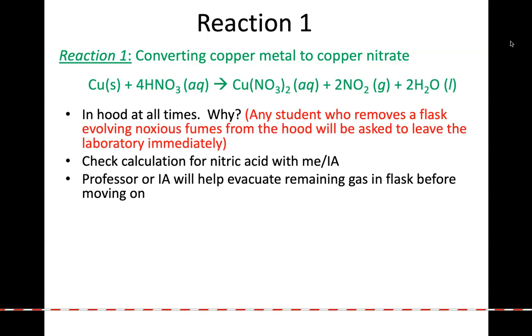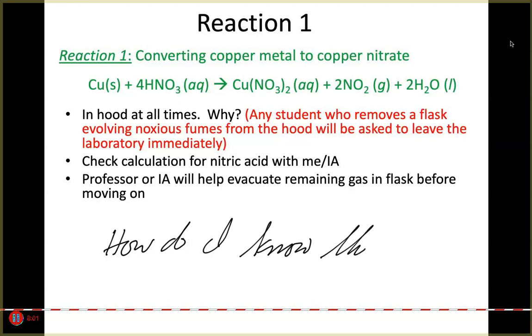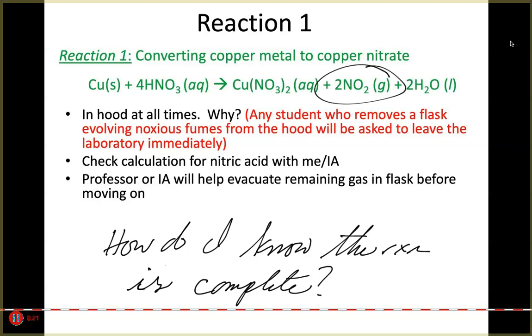So basically, there are some of the summaries right here, but things we need to think about, right? This is something to think about in the future when we get to week 2: how do I know the reaction is complete? I'll leave that up to you to figure out. How am I going to figure out the reaction is done? I'll give you the heads up. Something about generating gas might be part of it.